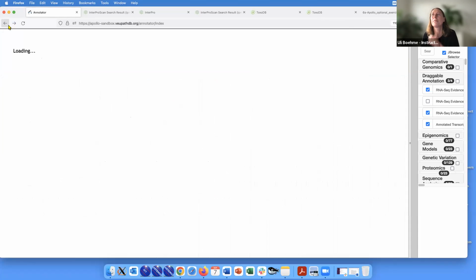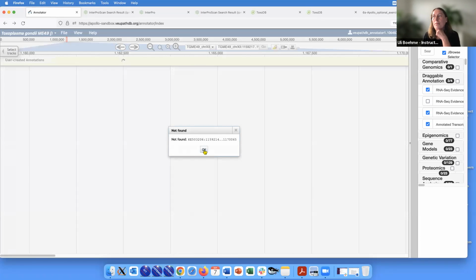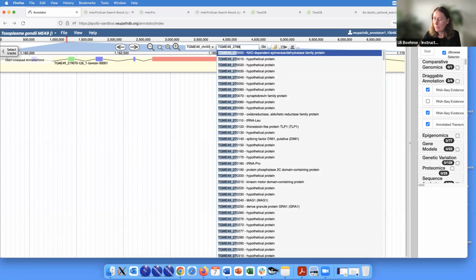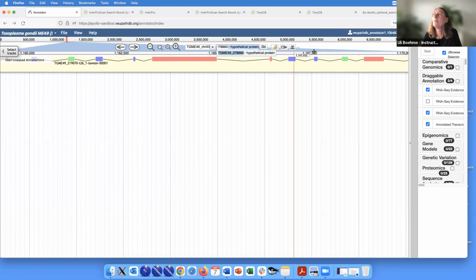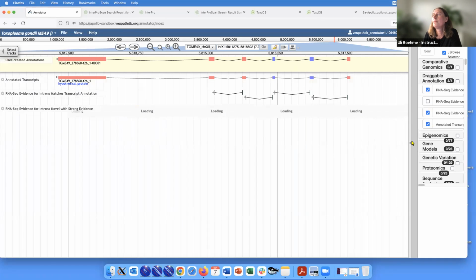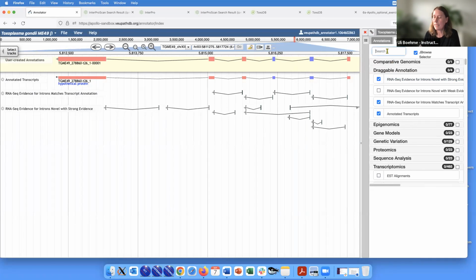Oh, sorry. Sorry, I clicked back by accident, but no problem at all. Let's go back to the gene. Select.